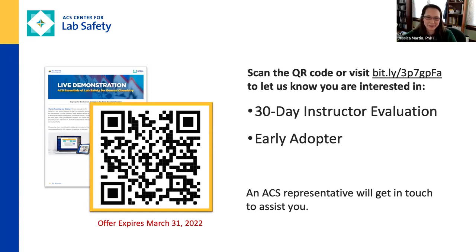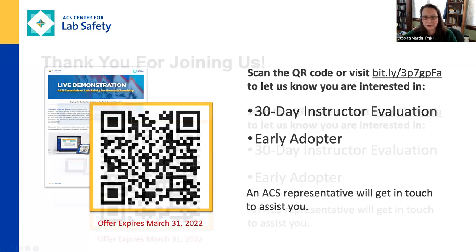Yep, and I agree with Mike. The information that's in there, it's good information to have if they are going to be entering a lab environment at any time. So it is absolutely still a good resource, even if they are doing at-home experiments. It can also sensitize them and start a conversation with you in terms of what they should have available if they are doing at-home labs, such as having some sort of water source available in case there are contamination issues, and how to address when they're running experiments. So the content is still very useful.